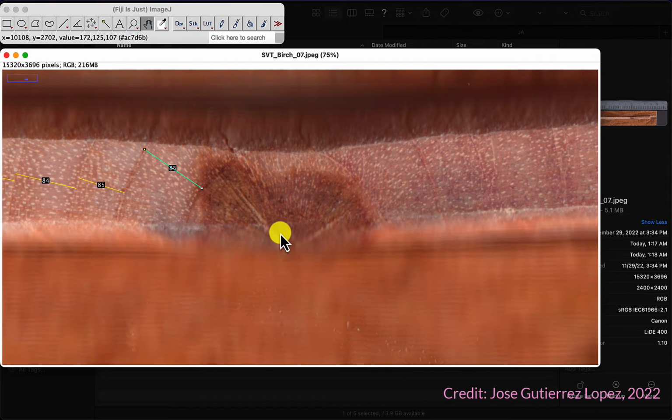This here for sure is the pith, so I guess we can consider that the first one. Yeah, we will leave it at that. If that tiny thing is the pith, then we could potentially claim that the last one goes to here, maybe? Yeah, maybe.